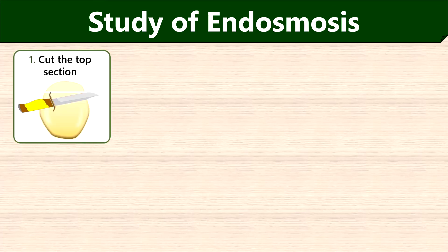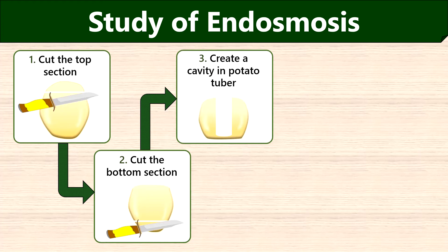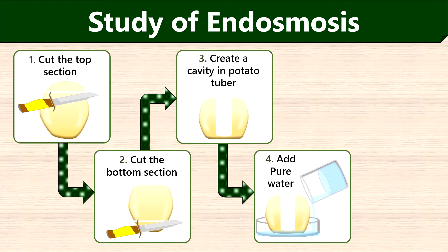Now we will discuss the procedure to study endosmosis using a potato osmometer. First, cut the top section of the potato. Then cut the bottom section so that we can easily place the potato on a petri plate. Then, using a knife, make a cavity from the center of the potato tuber deep into the bottom by leaving some space. Then keep the potato in the petri plate and add pure water to half of the petri plate.